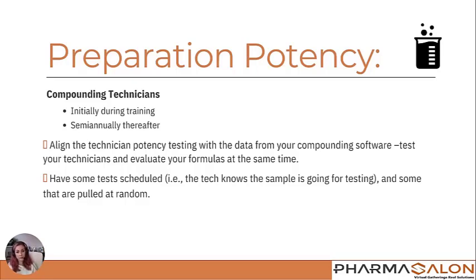Maybe I've got 5 technicians. I can assign 3 preparations to each one of my technicians. Two birds with one stone, right? Have some of your tests scheduled so the technician knows what I'm making right now is going to go out for testing. And if you can, have some of your tests that are pulled at random.